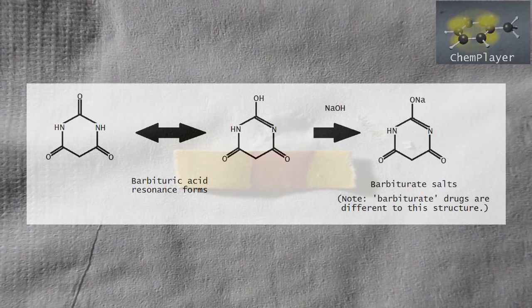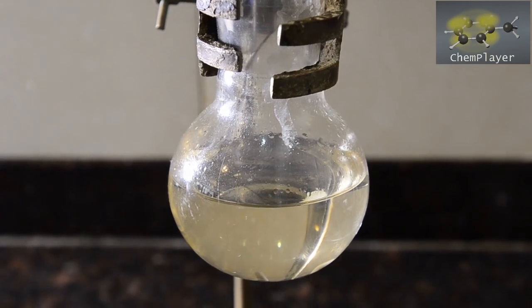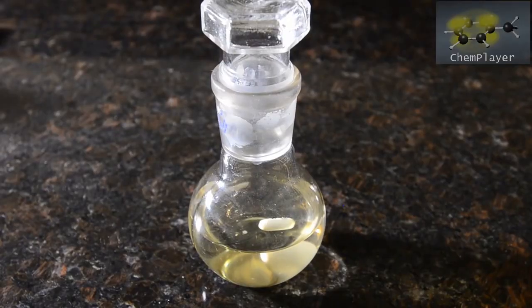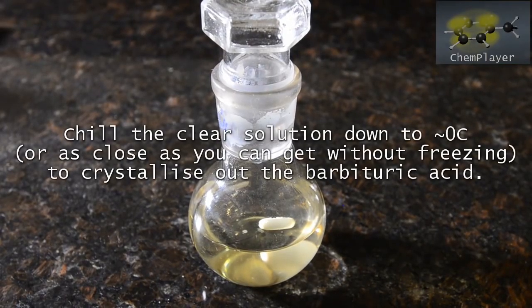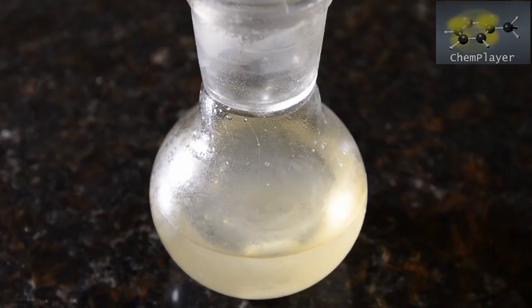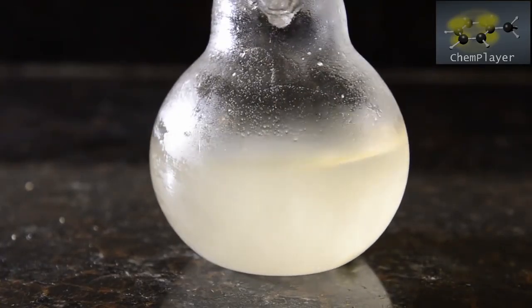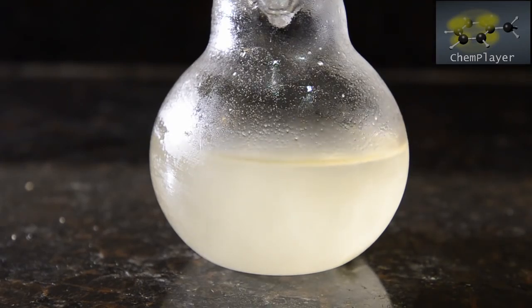This is still somewhat water-soluble, so in order to get it to crystallize, we need to chill the solution down to nearly freezing point for an extended time period. After only an hour or so of chilling, some white crystals are already visible in the mixture, as you can see. Let the mixture chill in the coldest part of the fridge, but without freezing, for 6 hours.